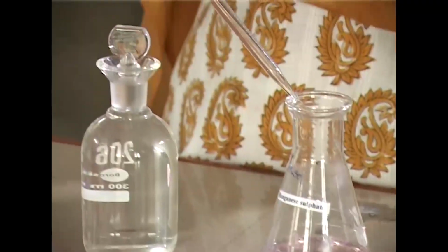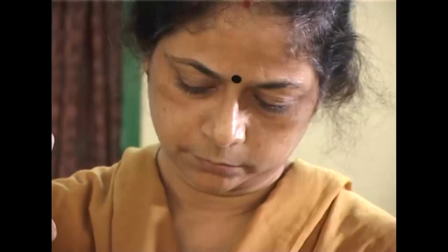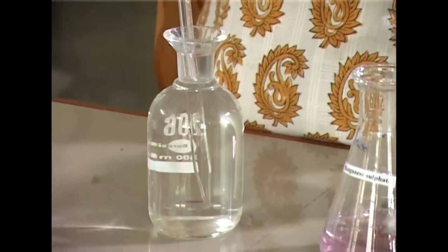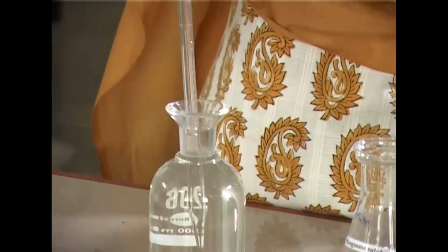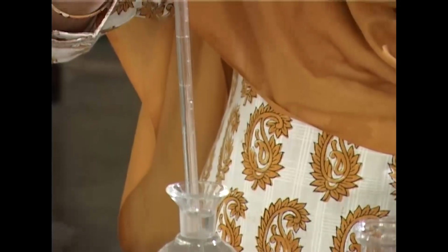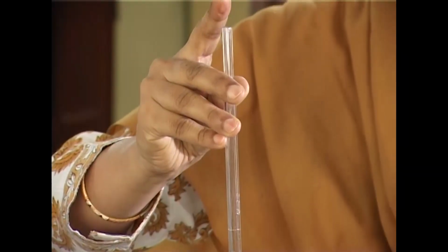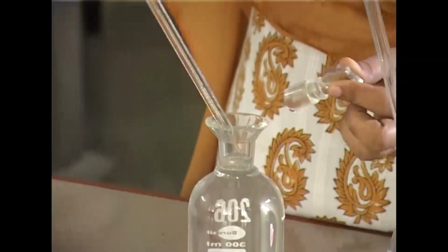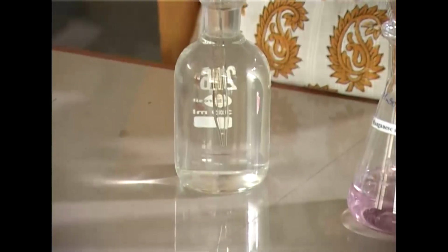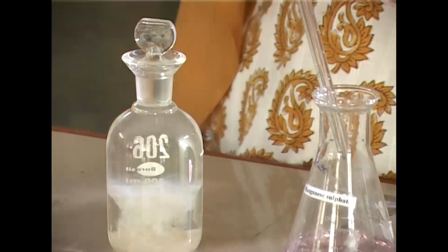Now, after this, we add about 2 ml of manganese sulfate to the collected water, and this addition of the manganese sulfate should be done with a calibrated pipette immersed inside the bottle. That means there should not be any oxygen or bubbling in the water. After addition of this manganese sulfate, we again add 2 ml of the alkali iodide azide reagent in the same manner without disturbing the water sample.